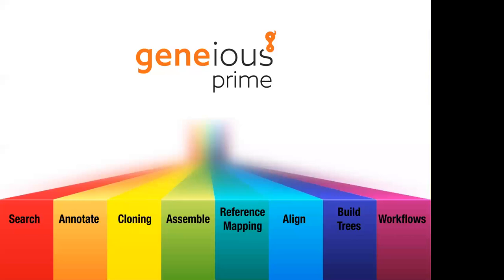And then finally, workflows. Workflows are my personal favorite tool within Geneious. They're a really great way to automate your analyses. So if you find you're doing the same thing again and again and again, even if it's something simple like building alignments and building a tree, then you can create a workflow in Geneious to automate that for you.